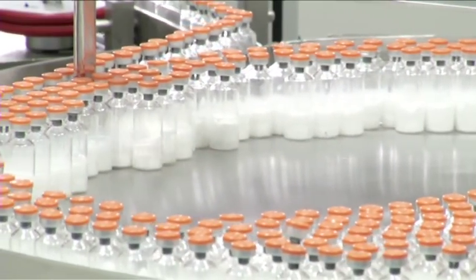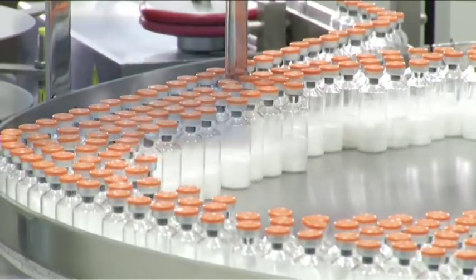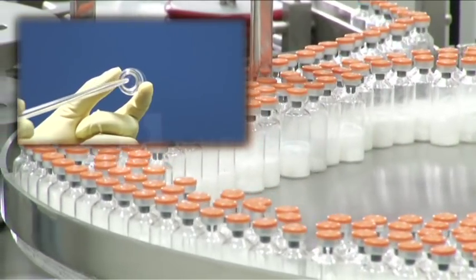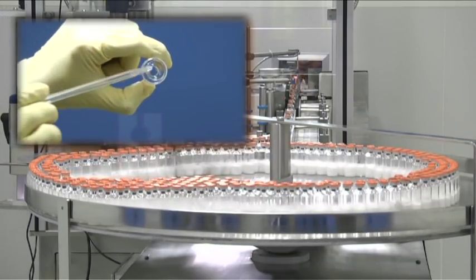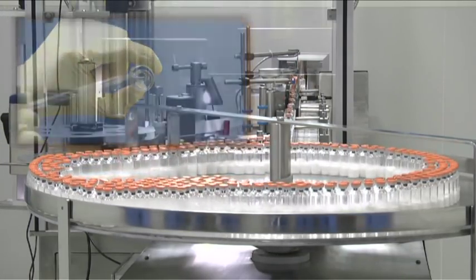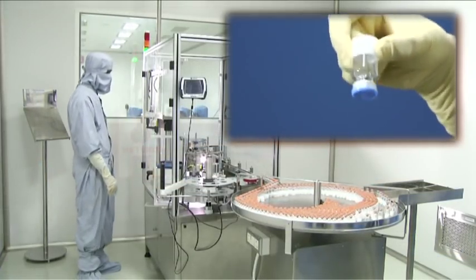For its lyophilized products, Hetero uses the Schott lyo vials. These vials have an ultra-thin hydrophobic layer on the inside and optimized flat-base geometry for high-efficiency freeze drying. This unique feature also prevents collapse of the lyophilized cake.